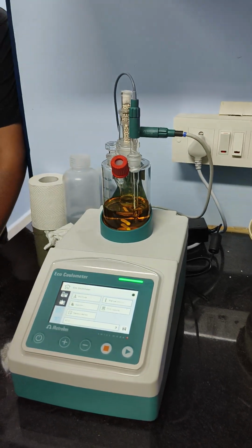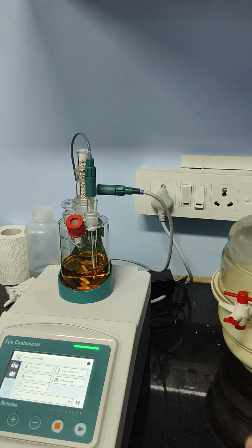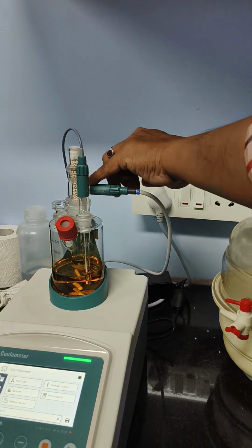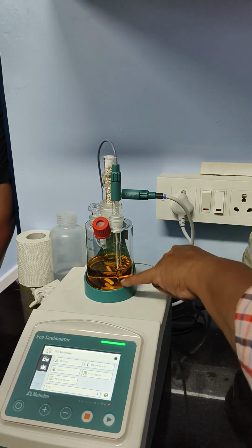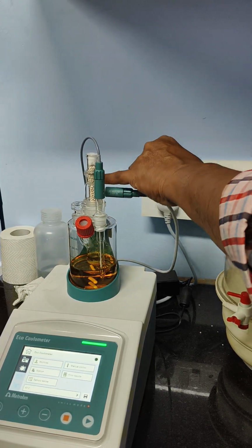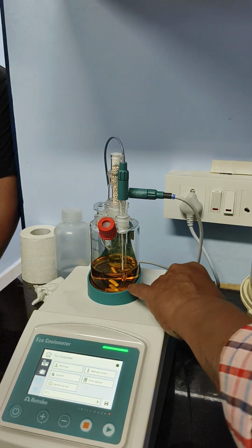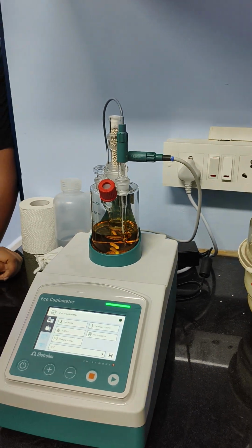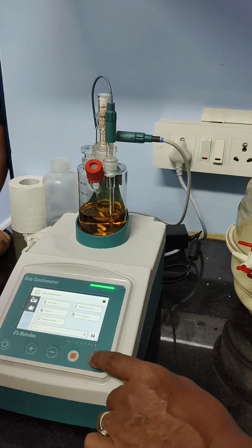Now the machine has been loaded with the reagent. What we fill is 100 ml of anodic solution outside and 5 ml of cathodic solution inside. There is a titration vessel with a stirring bar inside, and this part is called the indicator electrode and this is called the generator electrode. We have filled the anodic and cathodic solutions, and we can start the measurement. The only job of a research scholar or MSc student is to come and press start here.